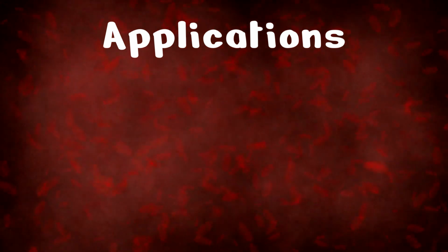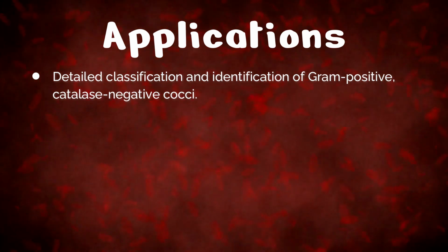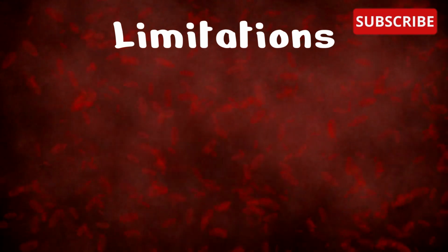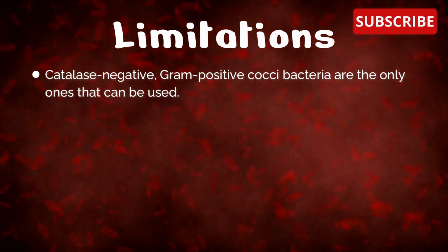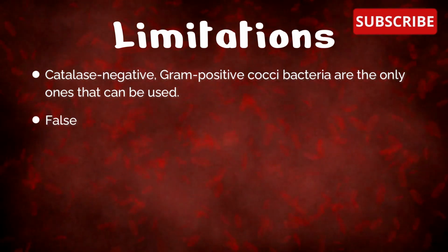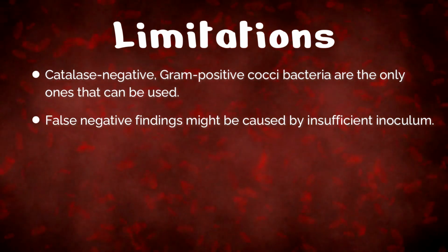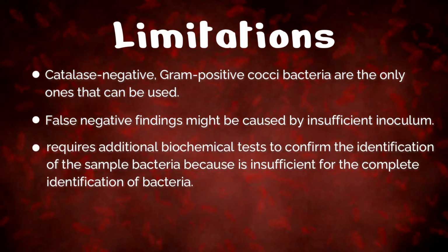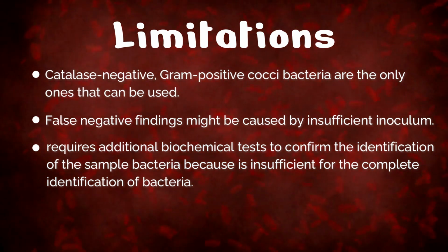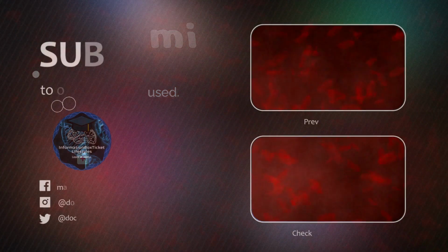Application of the lab test: detailed classification and identification of gram-positive, catalase-negative cocci. Limitations of the lab test: only catalase-negative, gram-positive cocci bacteria can be used. False negative results might be caused by insufficient inoculum. It requires additional biochemical tests to confirm the identification of sample bacteria, because it is insufficient for the complete identification of bacteria.